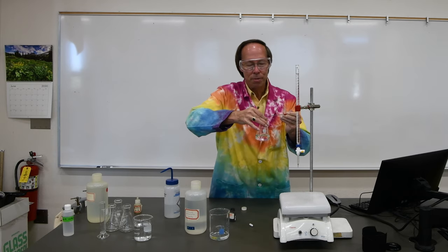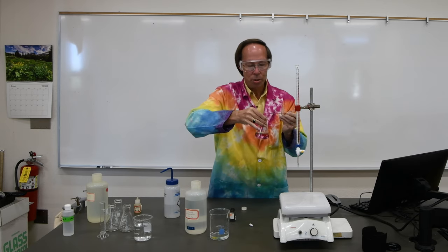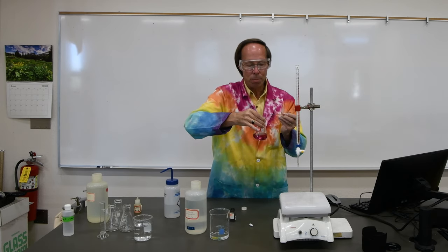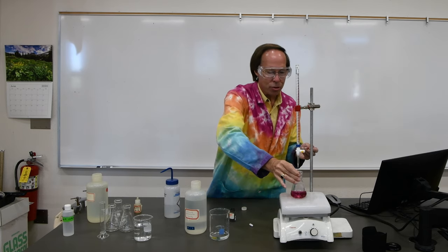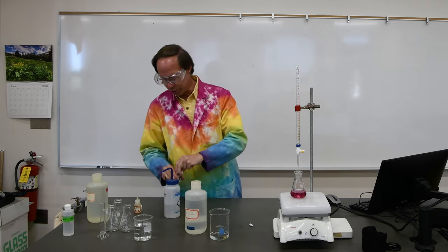So let's sprinkle in a few specks of indicator here. We'll swirl it around. Ooh, see that lovely red color? We want it to be dark enough, but not too dark. That is probably an excellent color. We can put maybe just a couple more specks. We don't want it to be so dark that it's hard to see. So now you notice that we've got that red color that indicates the presence of calcium.